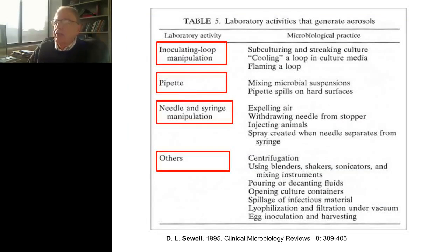So in this slide, this is from that same article in Table 5. This looks at activities that generate aerosols. You have your inoculating loop manipulation. So even streaking for isolation can cause aerosolization.